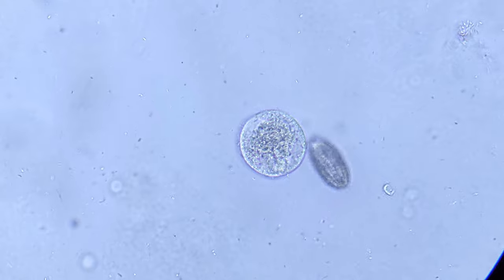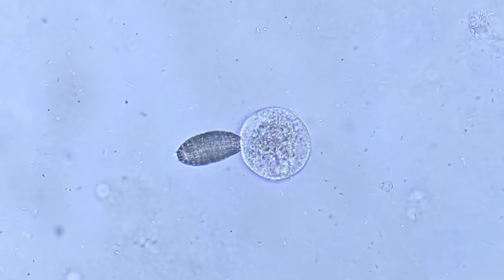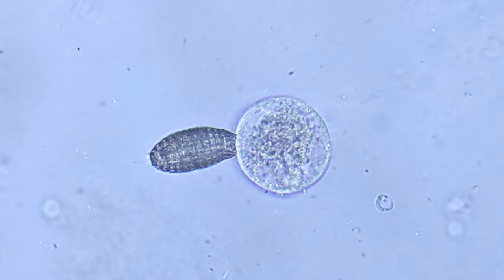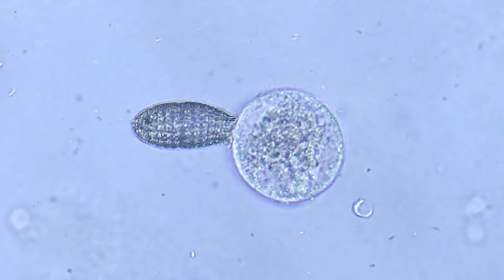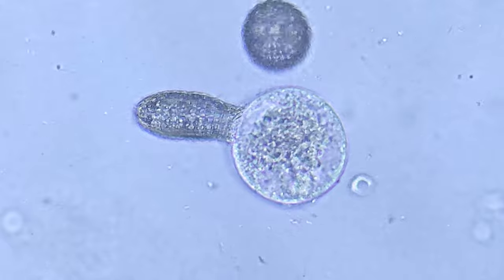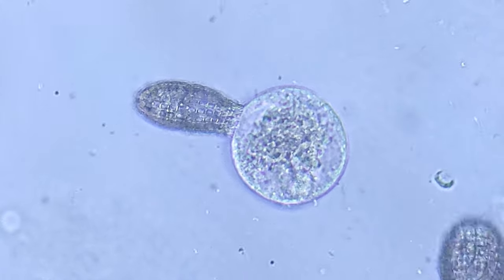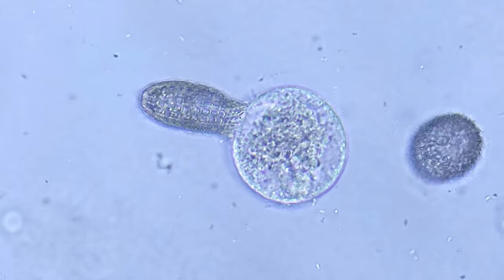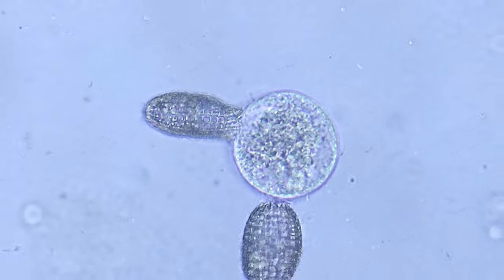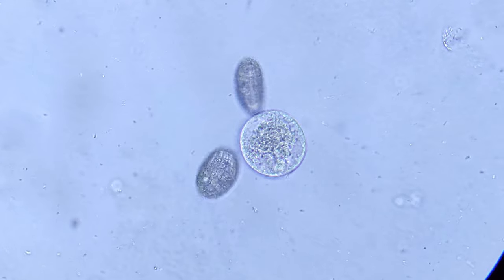Just as a comparison, you are now seeing through the same microscope at a higher magnification and using a common bright field illumination technique. This is an aggressive scavenger called Coleps. They are normally moving around very fast and at the first sign that something is dying, they attack — sometimes by themselves and sometimes in groups, pretty much like piranhas in the river. Coleps can sometimes swim in a straight line and sometimes in curves, but usually they are very fast which makes them difficult to get a good look at. Luckily here, these Coleps are after something that is stuck to the glass slide.